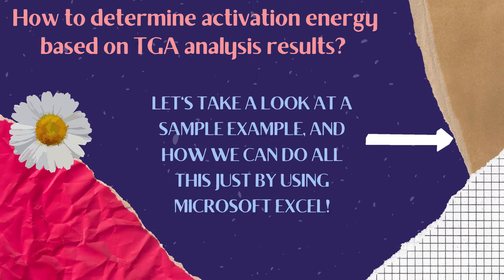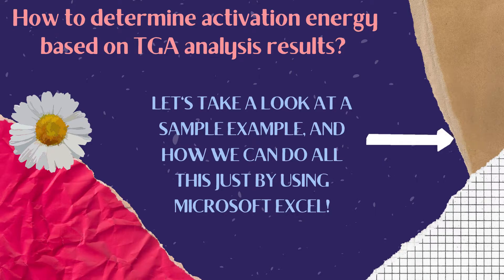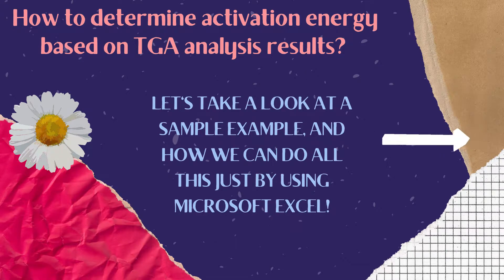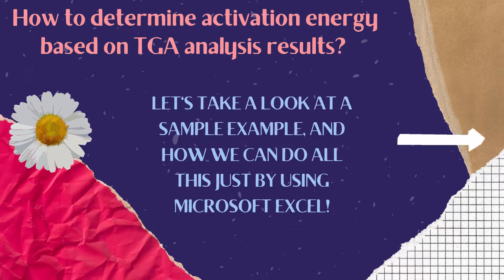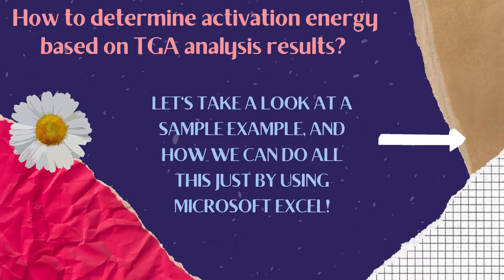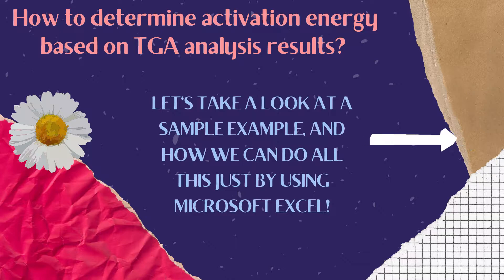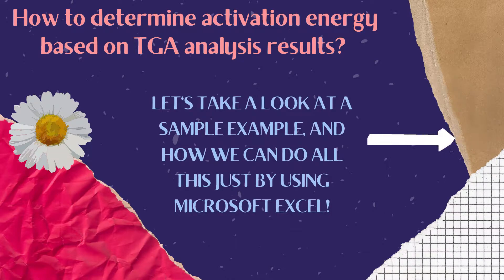How do we determine the activation energy based on TGA analysis results? Let's take a look at an example and how the determination is possible just by using Microsoft Excel.